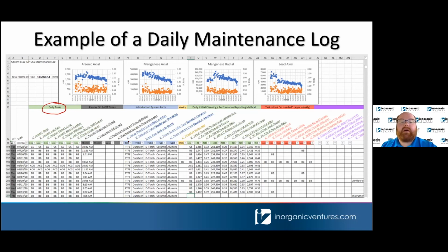But over here, we log the spray chamber that we used and the nebulizer used. These kind of dictate the kind of counts that you expect to see, but also could be the source of washout issues. If you had a bad RSD day, you suspect washout. Oh, it's because I'm using the older Teflon spray chamber. You might be able to trace those kinds of issues. And also what kind of torch you use. Most of them are fixed glass, but they've come out with fully demountable torches, or D torches, where you can change the outer tube and even the injectors. So those have different implications for washout as well.